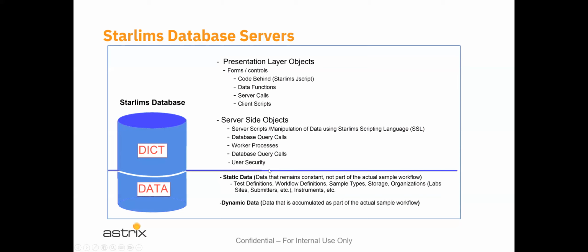And then we have user security, and this is where all of the user management occurs for logins, for privileges, roles, and site login. STARLIMS accommodates multiple sites or multiple laboratories, and there is a great deal of control about how users are defined such that it can access given labs or given roles within those labs, and that'll be part of a different training.